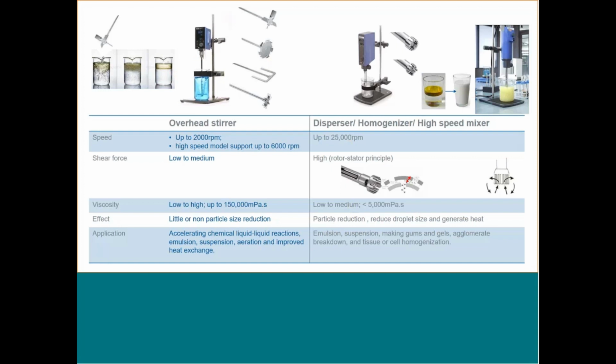And since the homogenizer is an open configuration, normally 15 to 120 seconds, you can already disperse all your samples. So we recommend you keep your dispersing time within 2 to 5 minutes. Okay, further dispersing beyond 5 minutes basically won't significantly reduce your particle size, it will only generate excess heat. So please be aware that if you are handling heat-sensitive ingredients, please keep your dispersing time short.